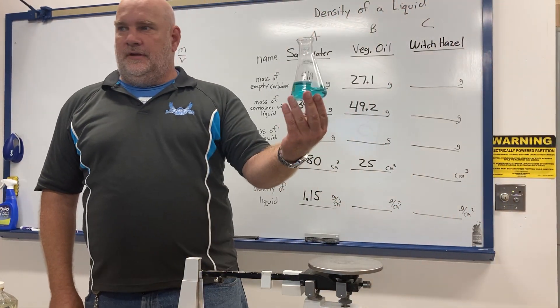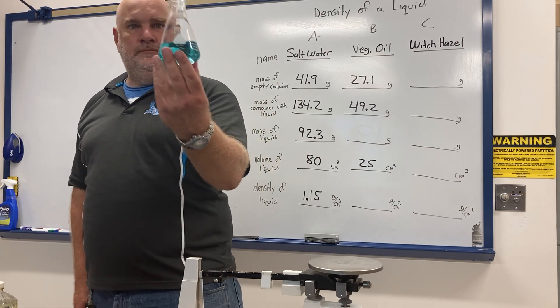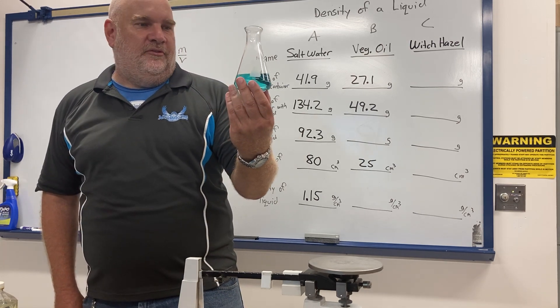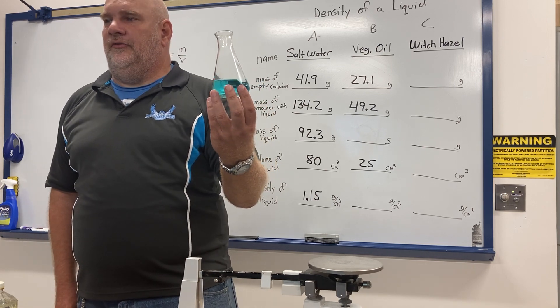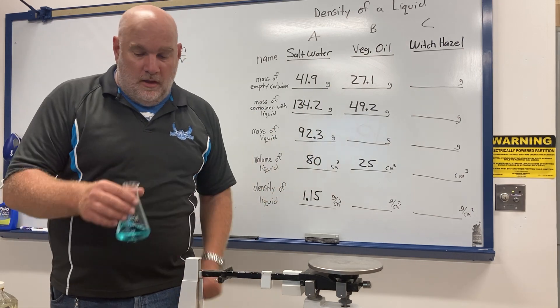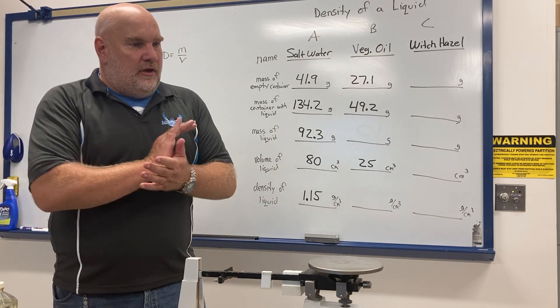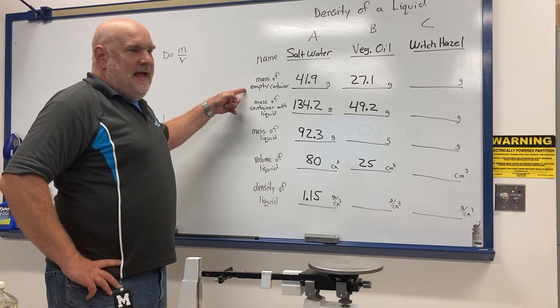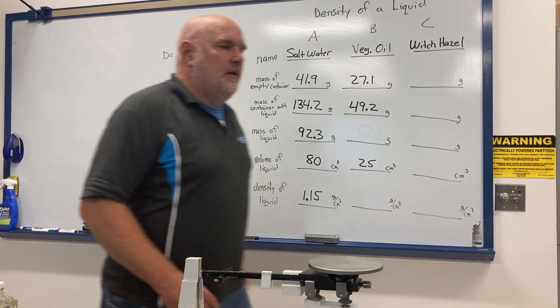Here's the witch hazel. Witch hazel isn't normally blue — I put some food coloring in it so you can see it better. It's normally clearish. For the witch hazel, I'm going to use a graduated cylinder for measuring, just like I did for the salt water.